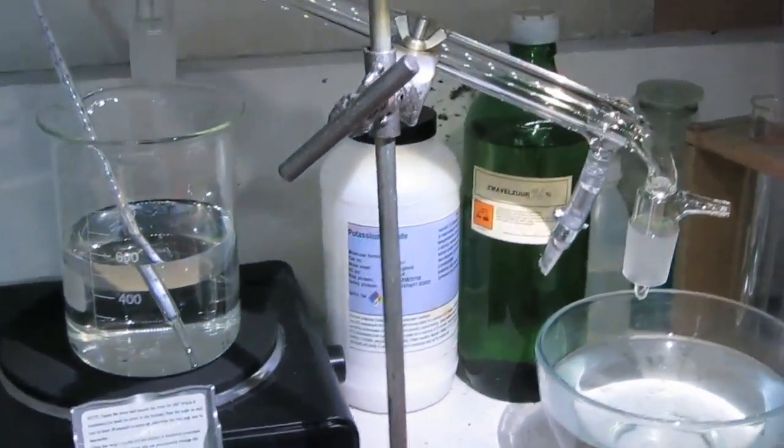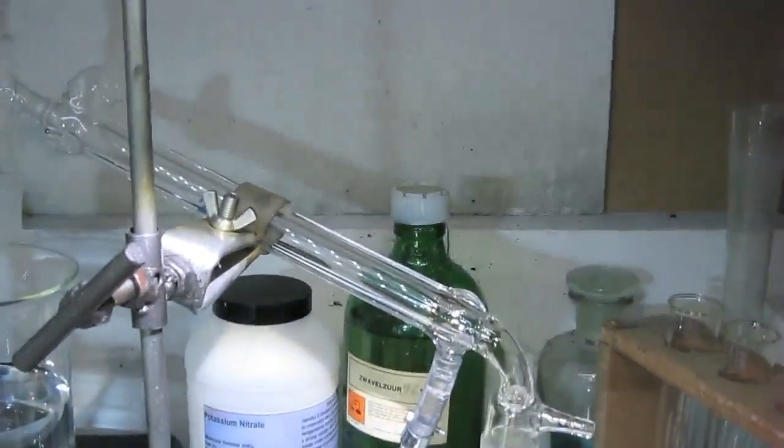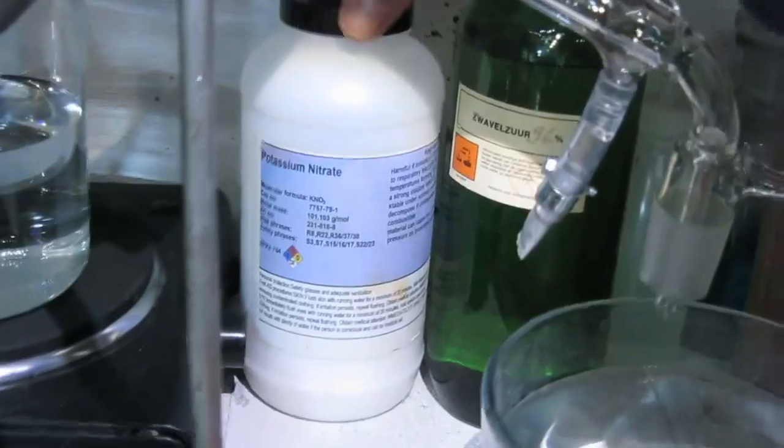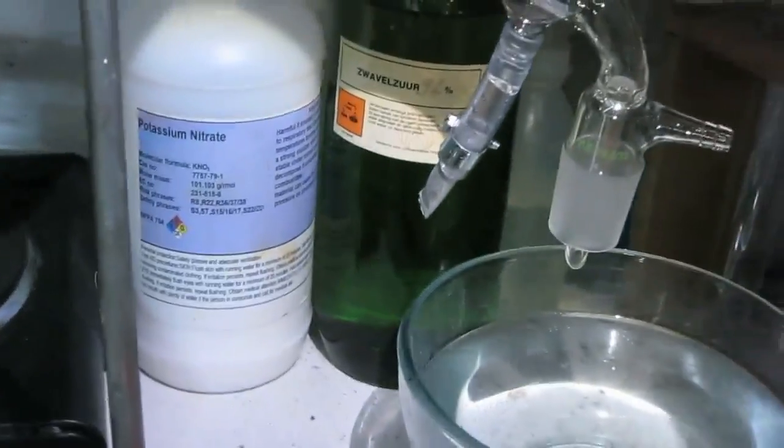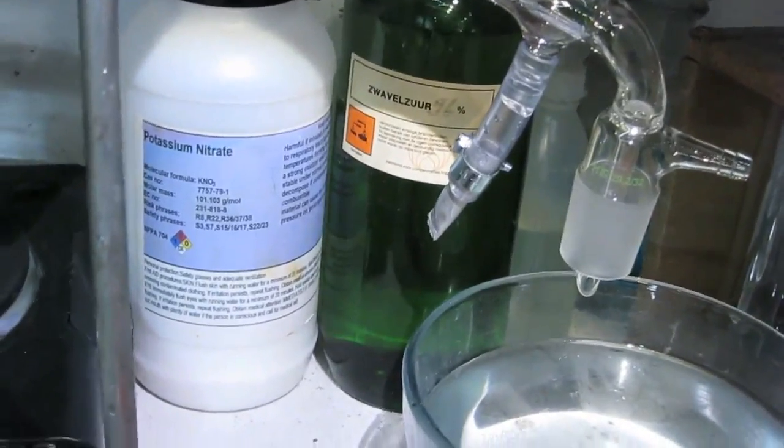The next experiment. I'm going to make nitric acid of a high percentage over 90% from potassium nitrate KNO3 and concentrated H2SO4, concentrated sulfuric acid.